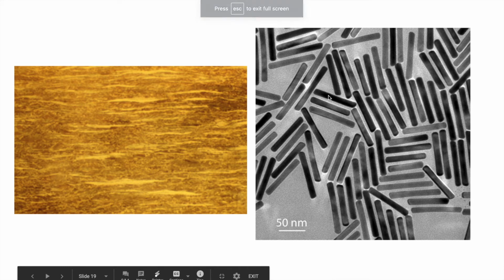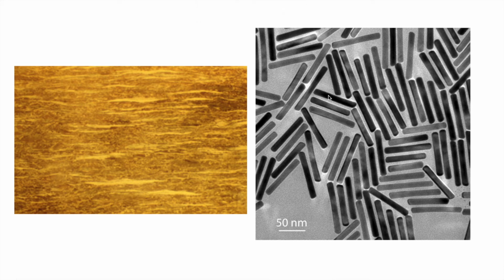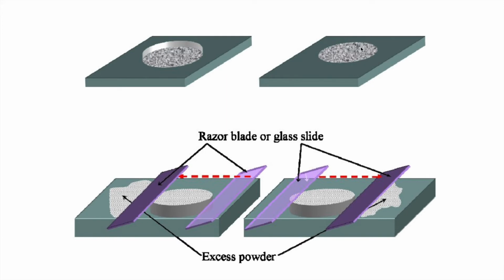Because of this preferred orientation or texturing, ideally for powder X-ray diffraction, we don't want samples like this, unless we want to study what's going on with the texturing or orientation. Instead, we prefer what's shown here: we want a large number of crystals, and we want them to be very small, and randomly oriented so that we get the ideal mix of relative intensities from sample to sample.